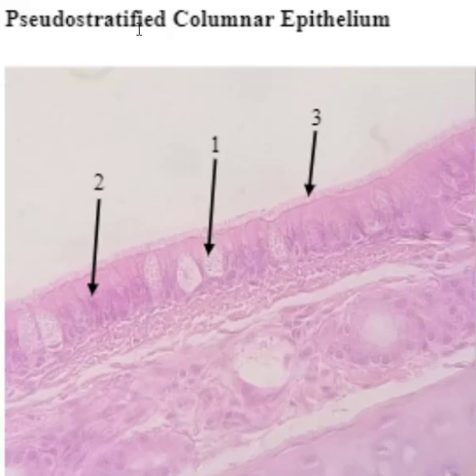Okay, so the other thing that you need to look at in this particular sample is you can see little hair-like projections sticking up here. So these are not microvilli because you can't see them. You cannot see microvilli using our light microscopes. But if you're using this tissue and you're looking with the light microscope, you can see those little hair-like cilia. So these are cilia, not microvilli. So I want to make sure that you have those 2 things straight. So number 3 is the cilia. This particular piece of tissue happens to come from the trachea.